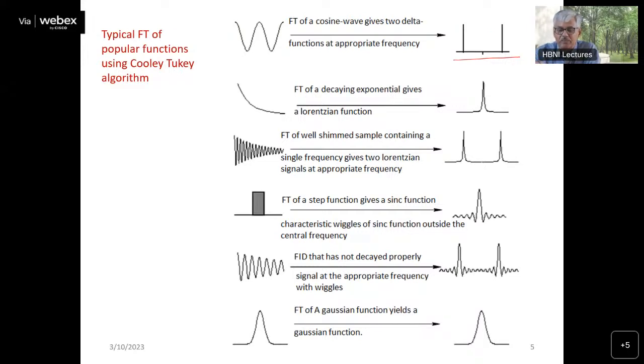Suppose you have a decaying exponential curve. You can consider this as on resonance, meaning the magnetization decays exponentially along the y-axis only, where the detector is fixed.